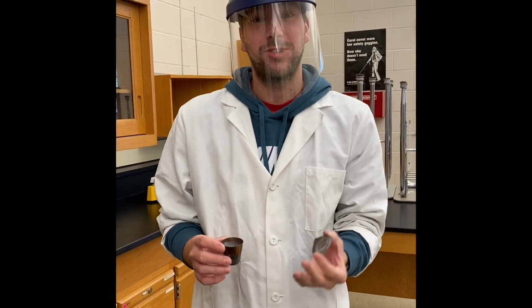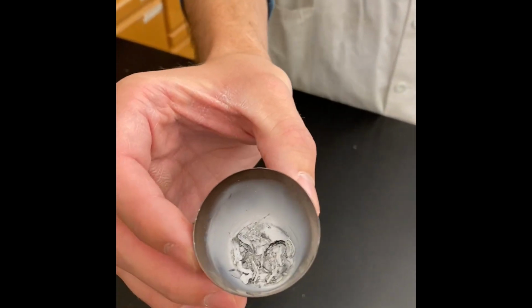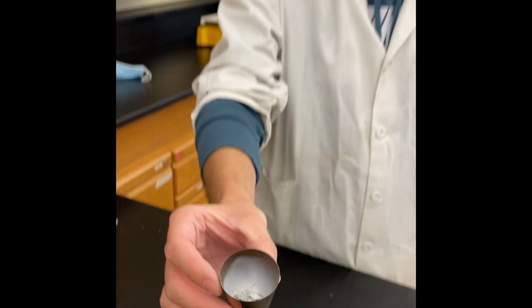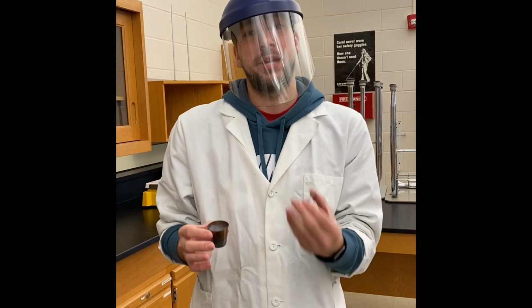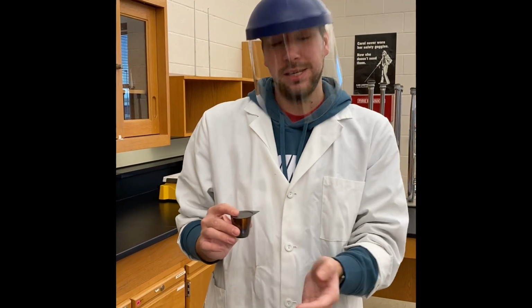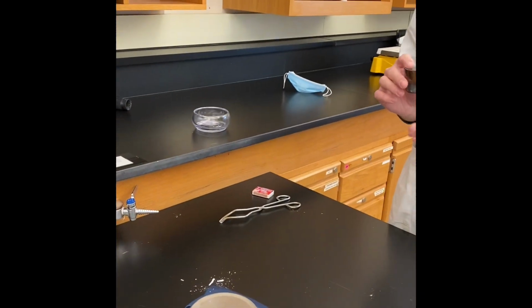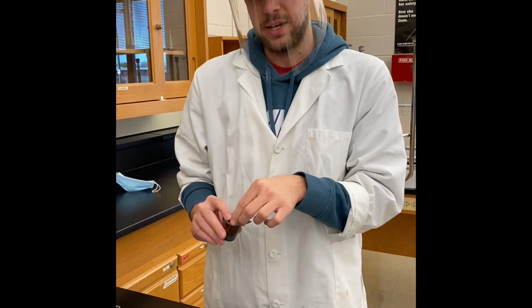Okay, so now our reaction is completed. As you can see inside the crucible, we've formed that white substance that is the magnesium oxide. And you can tell I'm holding the crucible, so we've given it time to cool down. The reason this is important is because if this crucible were still hot and we took the mass, the heat would cause convection currents in the crucible, which provides lift, which would result in a lower mass. We don't want that to happen.